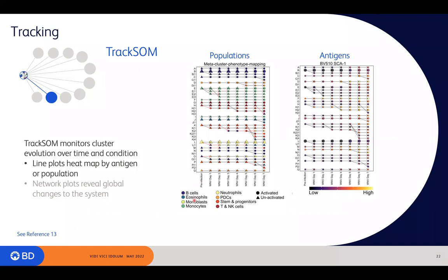Similarly, with the monocytic populations, in green here, you can see how those populations split very rapidly at the very beginning of disease onset, because again, they're the innate immune cells, so these guys are going to react a bit faster than, say, the humoral system would.